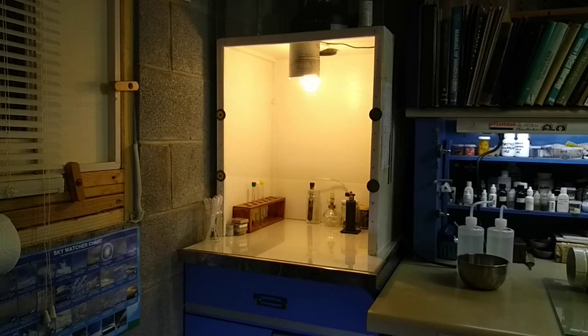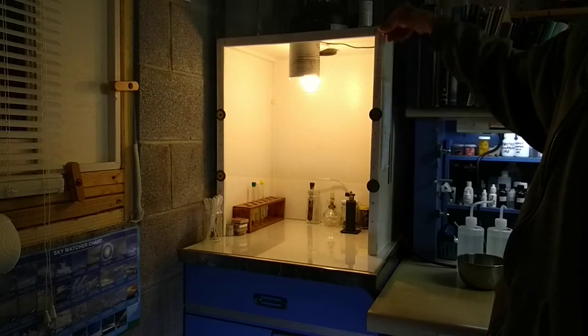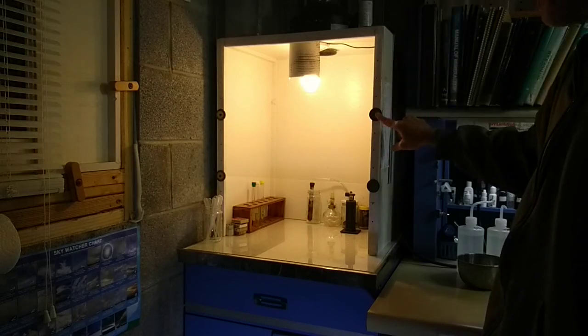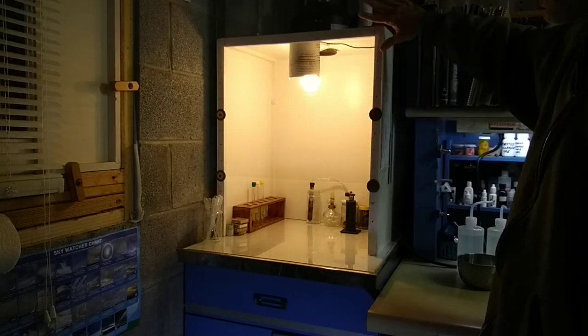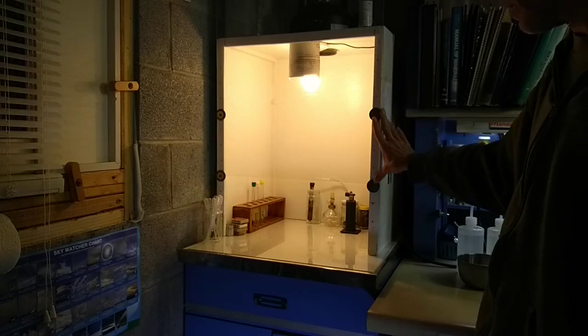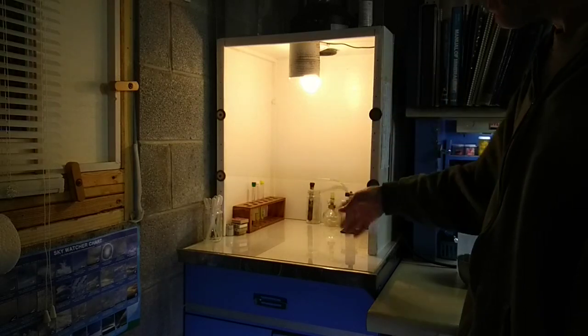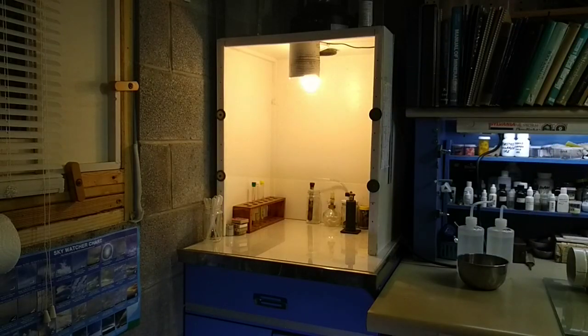And the hood is just plexiglass. I was going to make a sliding mechanism or something with Velcro that I could adjust, but I just have these screws with various holes, so I can adjust it in various spots. But I never move this. I just have it adjusted in a spot where it gets good airflow, and I also have good access, and I don't really have a need to move it after that.